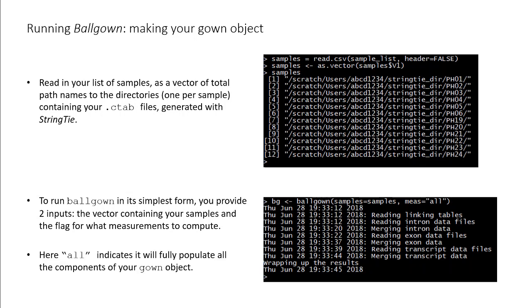Here, all indicates that the ballgown function will populate all the components of the gown object. The function processes the linking tables, intron data, exon data, and transcript data.